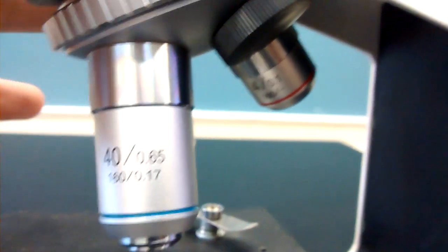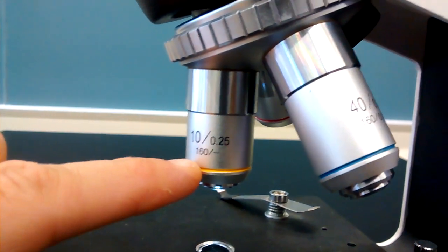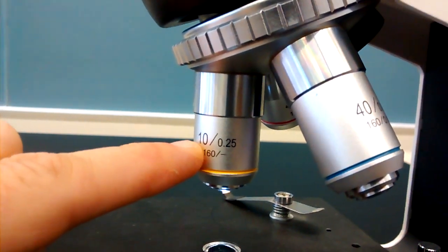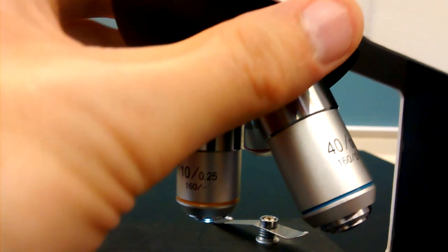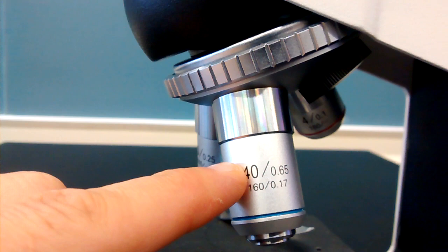The next lens is called our low power lens. It has this yellow band on it. And all by itself, it will magnify ten times. Finally is our high power lens, which has this blue band on it. And that will magnify 40 times.